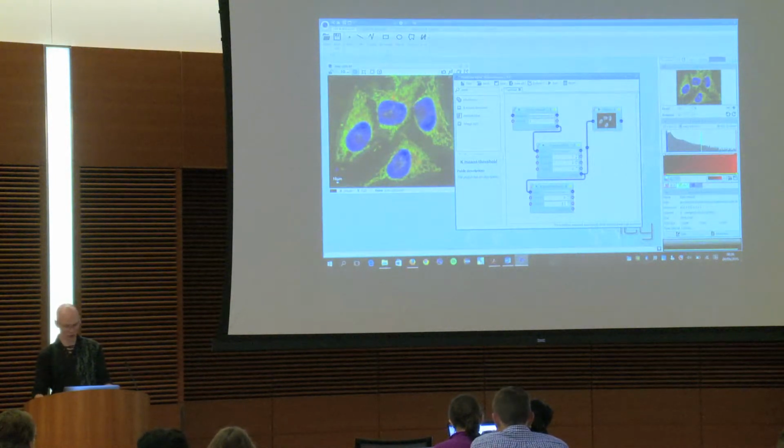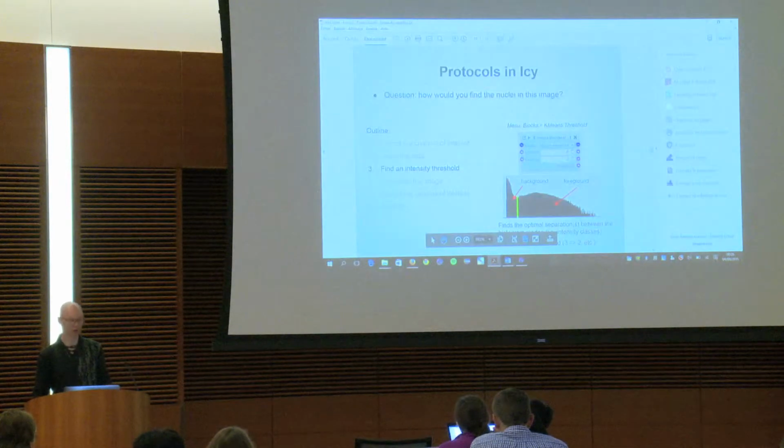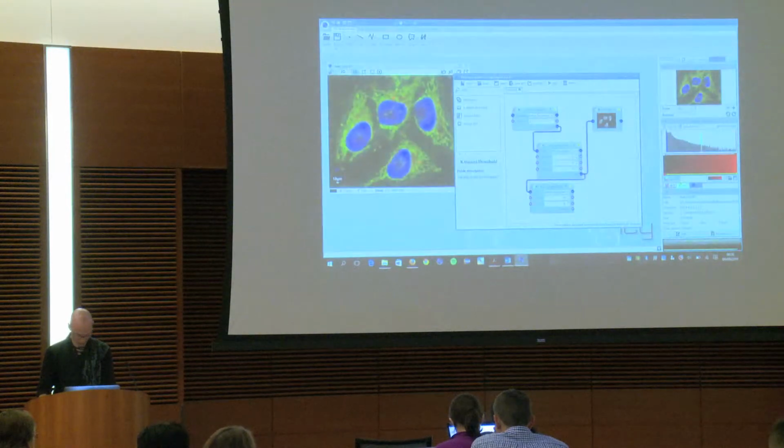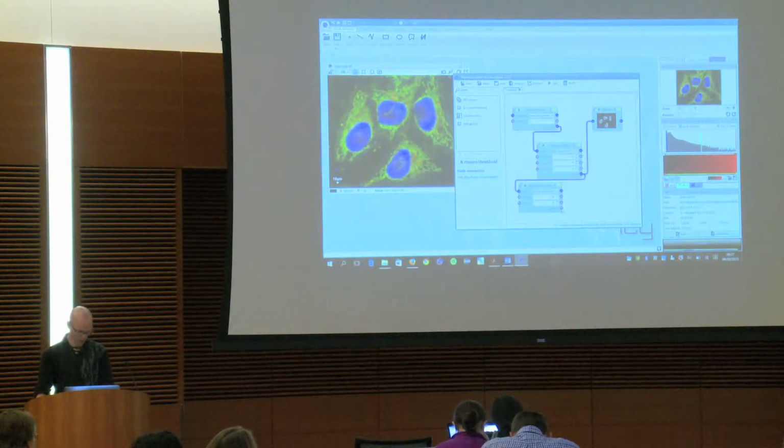So the number of classes defines how many groups you want to separate the histogram into. This is how the K-means works. It just separates the histogram into different classes and tries to find the best value for that. So if you want to separate the background from the foreground, we just have 2 classes. So we take this parameter, and you can see this time we don't have an image. We have a purple color here, so it means we have a numerical value.